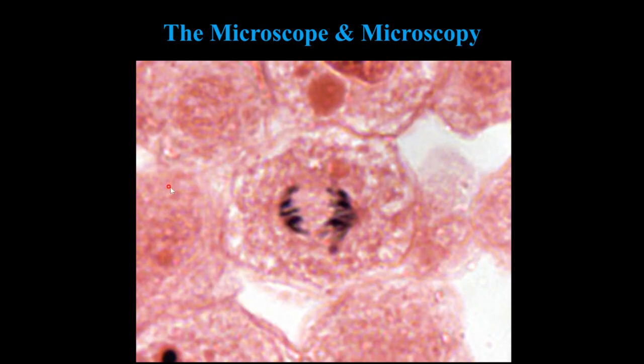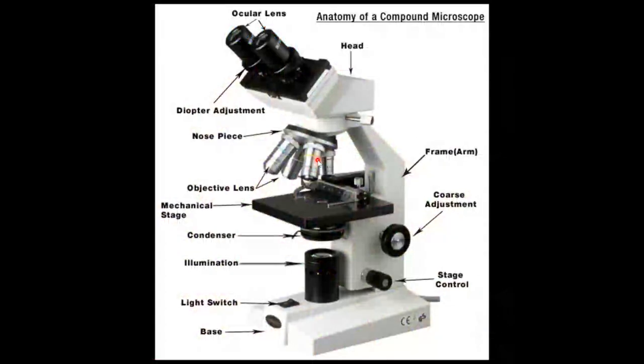The cell is undergoing cell division, known as anaphase of mitosis. You can see that right there. The "an" in this case doesn't stand for absent or without. It's part of the prefix ana, which is not on your list, but that means movement. The chromosomes have separated and are moving to opposite ends of the cell. We will get to mitosis in the not too distant future.